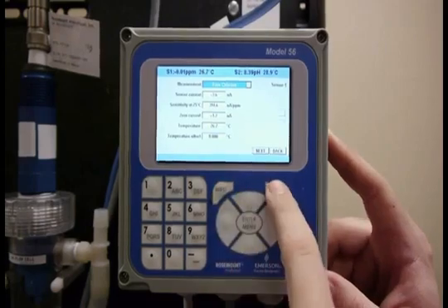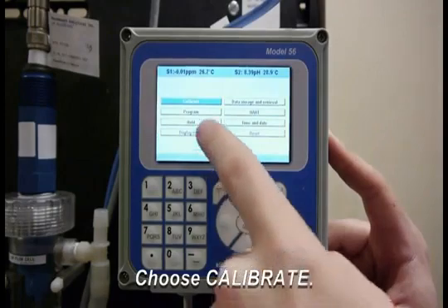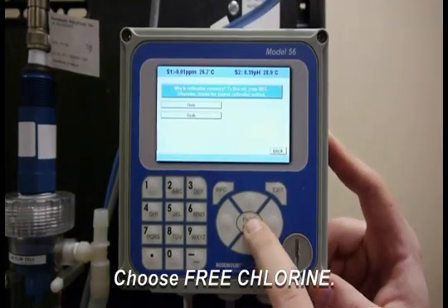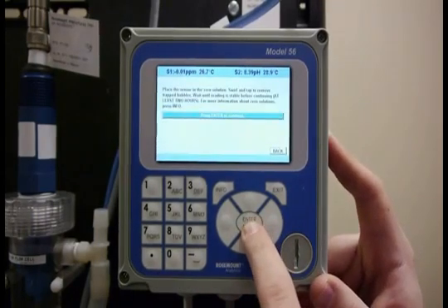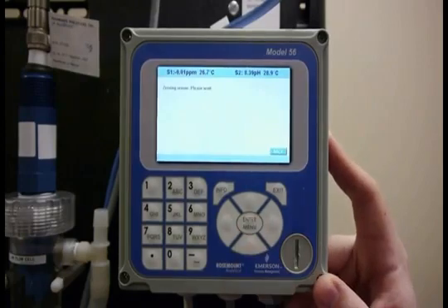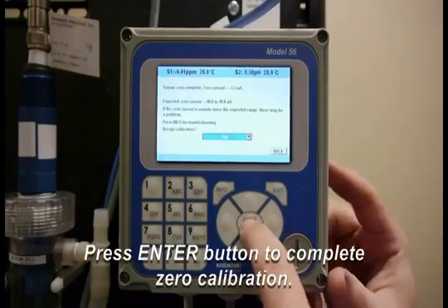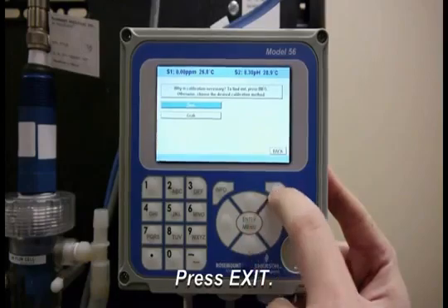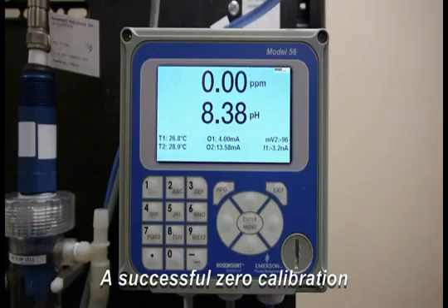I'm going to exit, then go to Enter for the menu. I'm going to go to Calibrate and do Sensor One, as it's our free chlorine sensor, and I want to do a zero sample. I'll hit Enter for the zero calibration and wait about 10 seconds. Then I'll hit Enter to accept the zero calibration, hit Exit, and go back to the start. Now I have set my zero for the sensor.